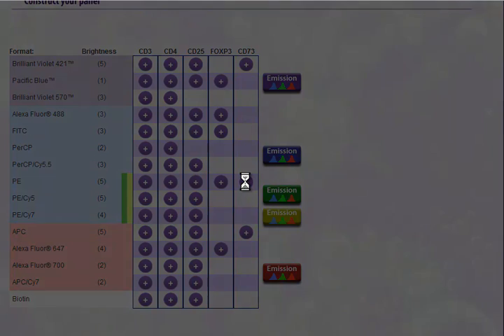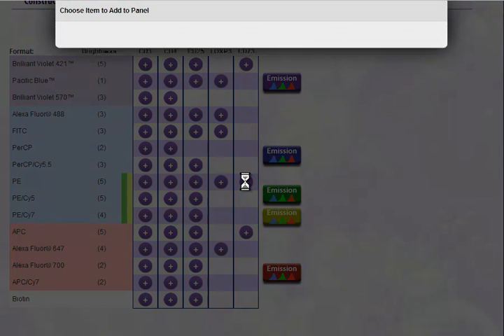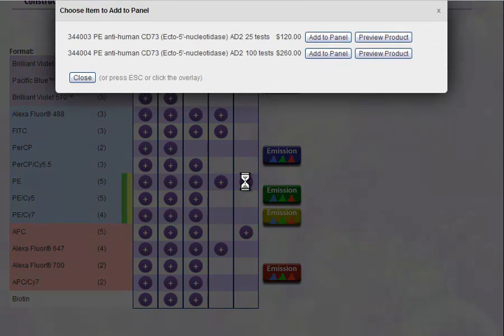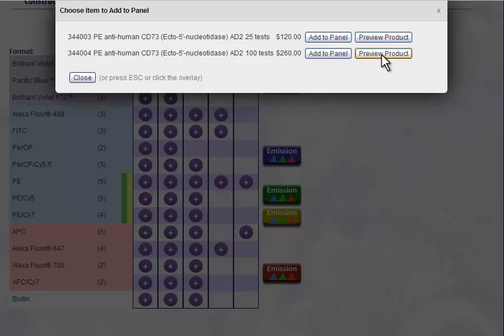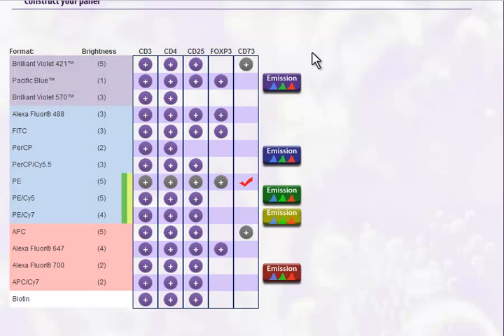Click on the plus symbol to open a new window to show available products. To help you choose products, you can preview the product datasheet. Select the product you want to add by clicking the Add to Panel button. Your selection will now appear in the Panel Items section down below.